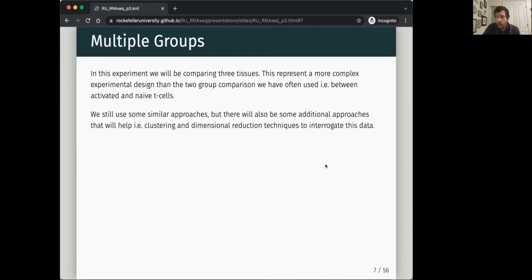Something I talked about last time is that what we're talking about today pretty much directly mirrors some of the stuff that we do in our own pipelines, and what we do in further analysis when we're working with people. So it's very much the same kind of code. If you do work with us, you can see how we generate these plots and have a good understanding of that. Or if you want to do it yourself, you know that it's a tried and trusted method, okay?